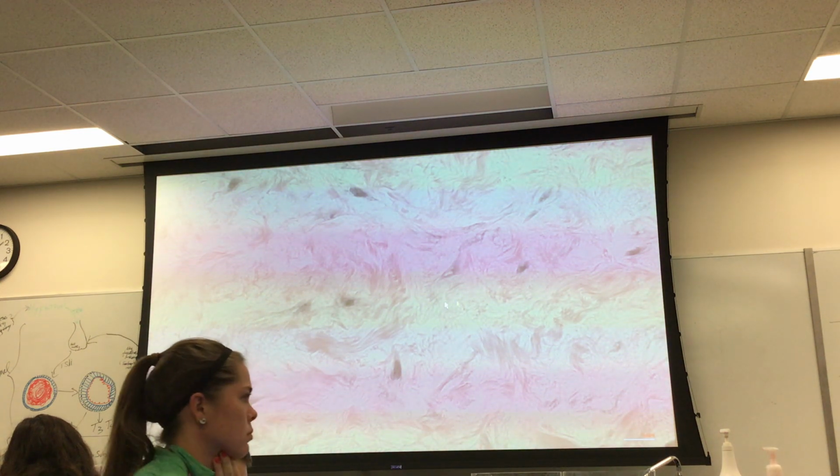You still have a substantial amount of ground substance, that is the clear space. If this were a loose connective tissue, you would definitely expect to see wandering cells, more cells than this. So it's only really one cell type, and they look pretty uniform. So those are the two embryonic tissue types.